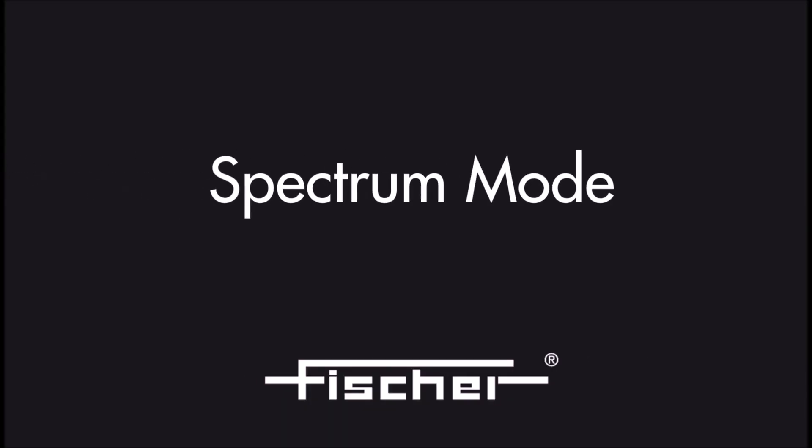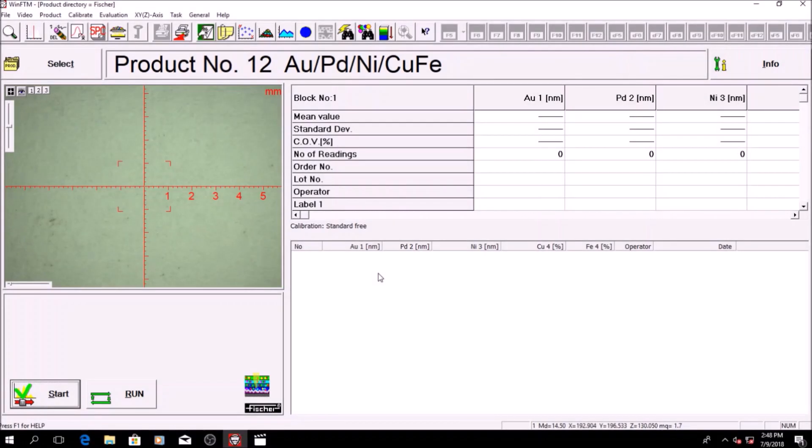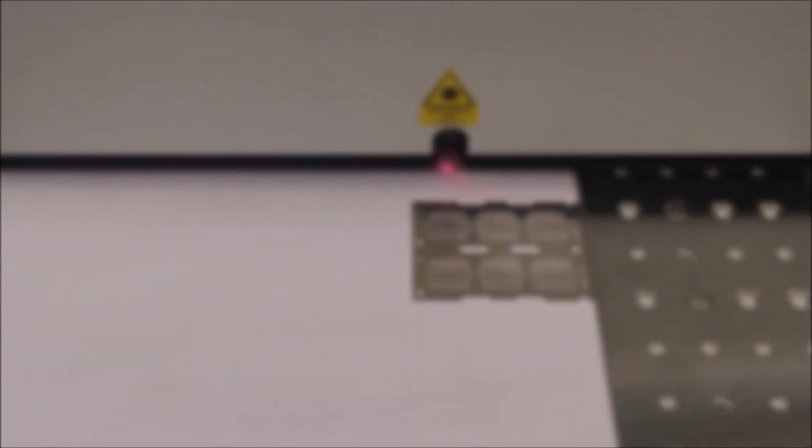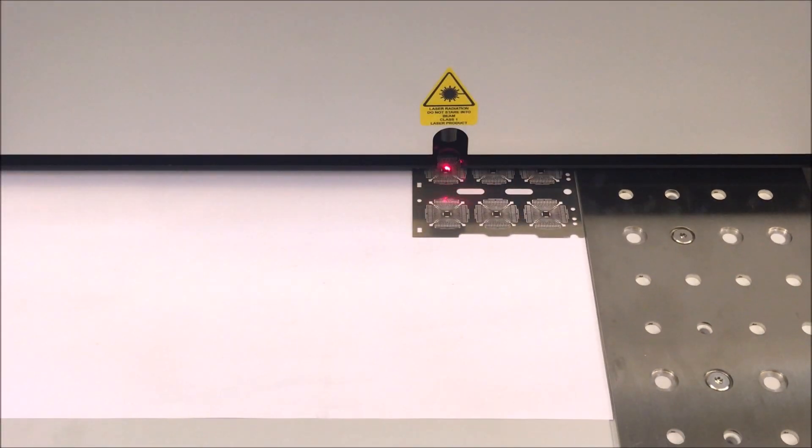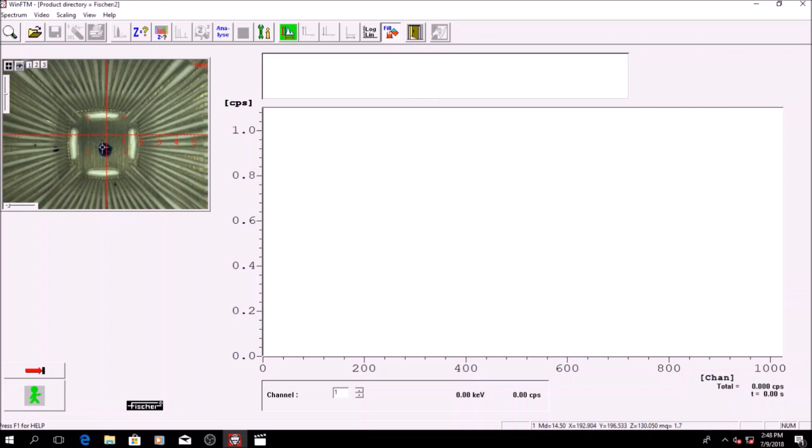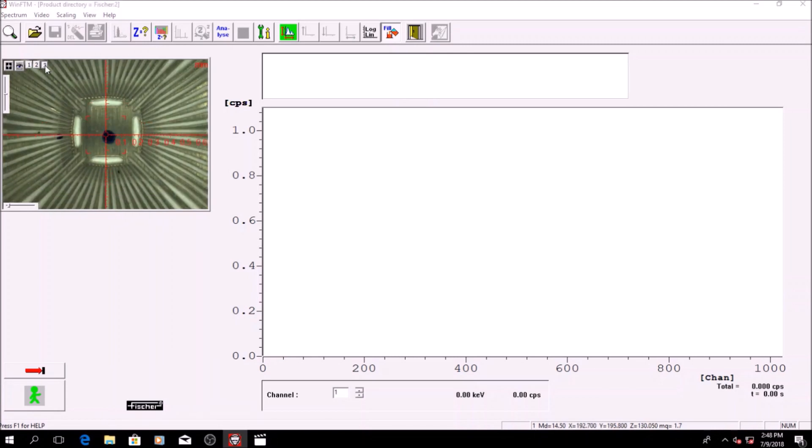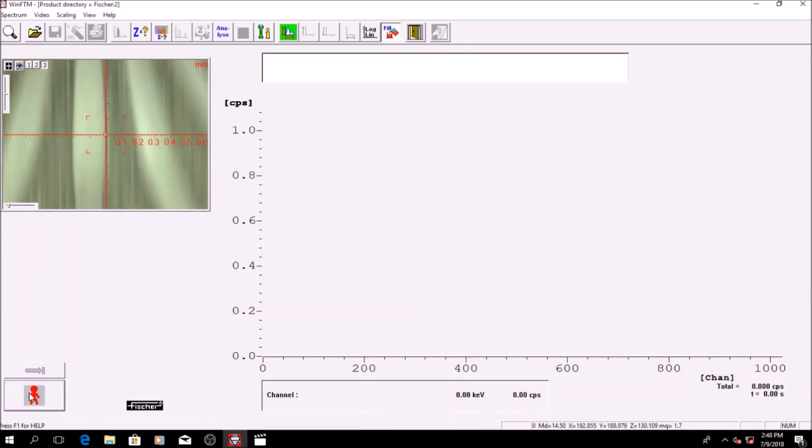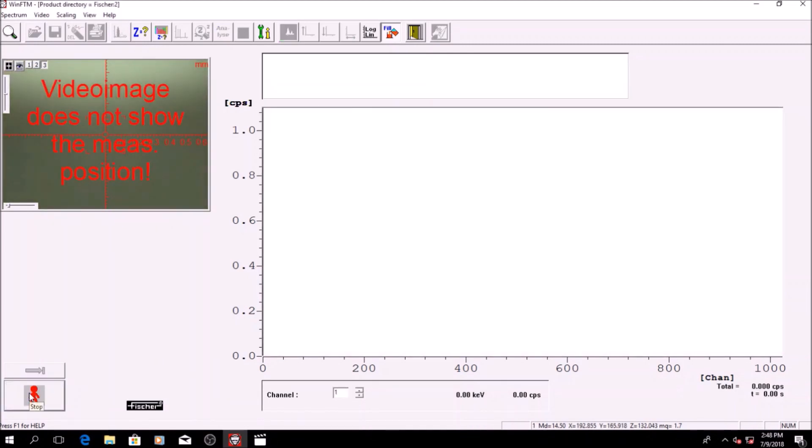Spectrum mode is used for a quick check on material composition. Simply place the sample under the detector unit and click run to measure the sample for a few seconds. The spectrum will appear.